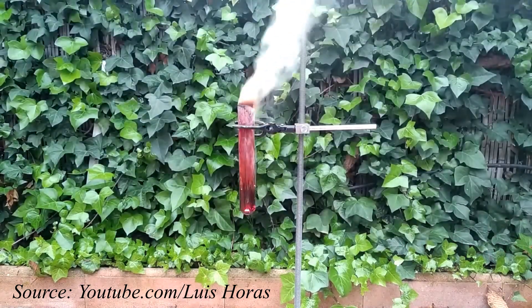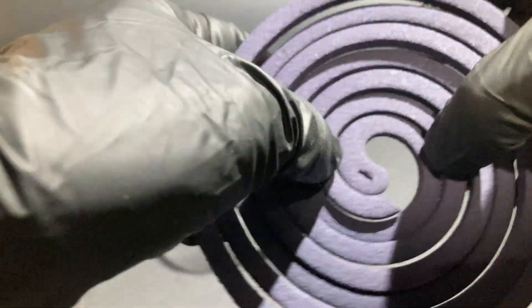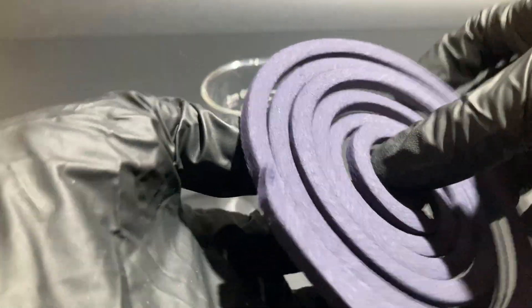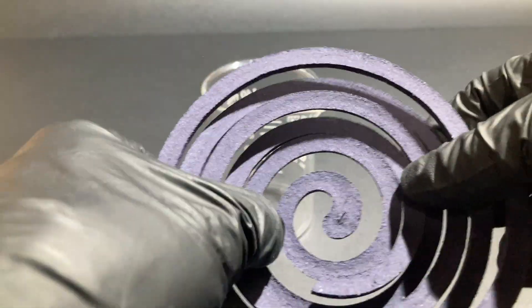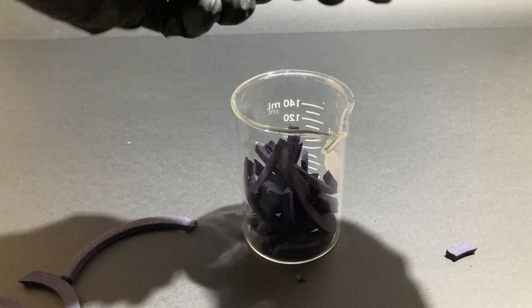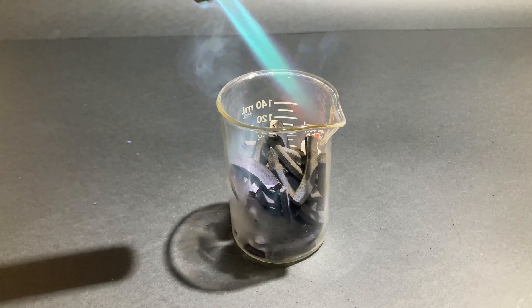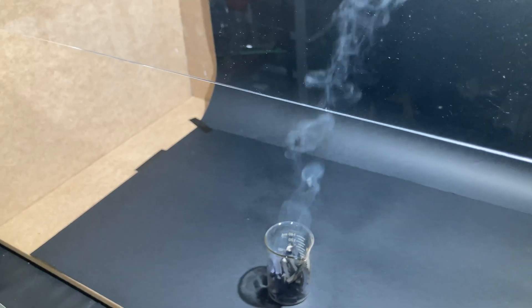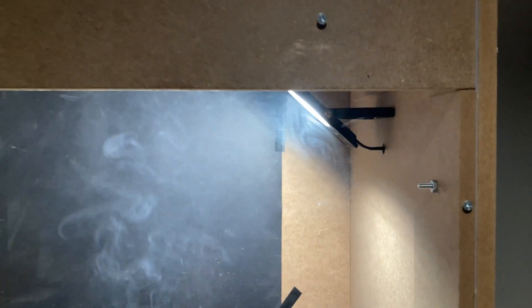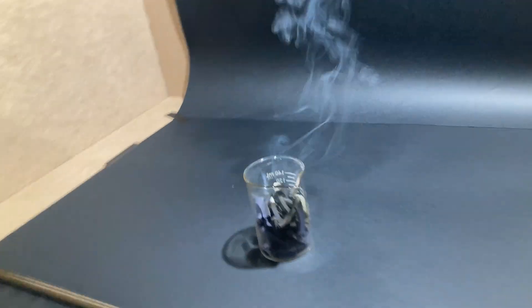So after all that explanation, let's go to the important part — we need to see this thing in action. To do so, I'll need to produce some fumes, so I am using mosquito coils for that. I cut the coils and put them into a beaker to light them inside the fume hood, and we can see how the fumes are sucked by the fan and taken outside of the room. There are some places where the fumes tend to accumulate, but after a couple of seconds all the fumes are removed with no issue whatsoever. Also, there's no smell in the room, so that's a good sign.